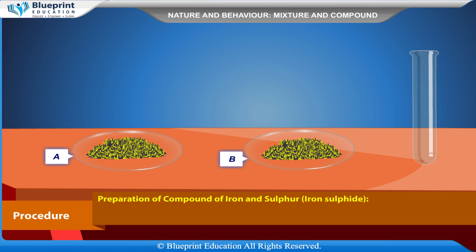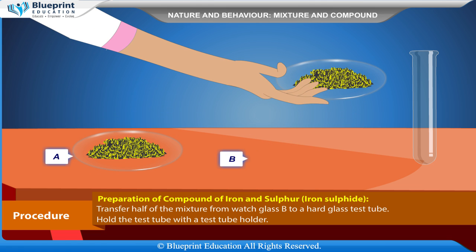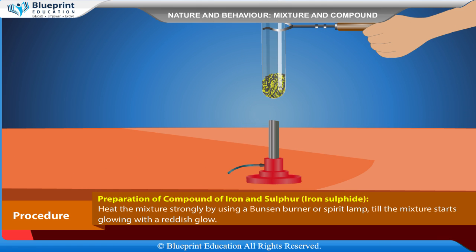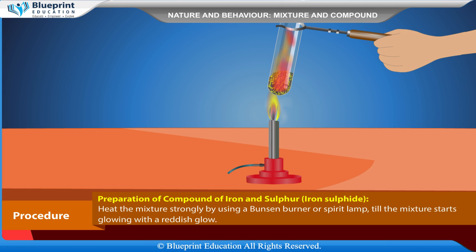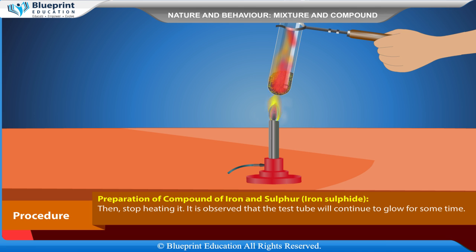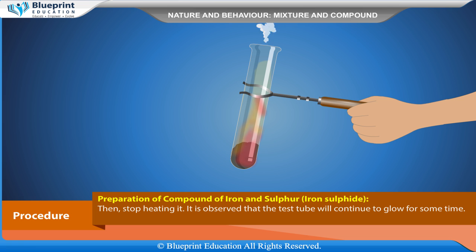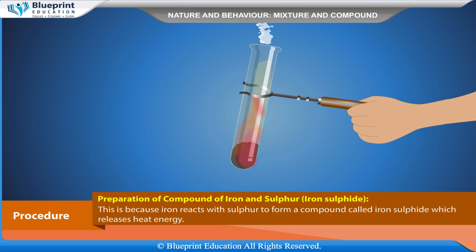Preparation of compound of iron and sulfur — Iron Sulfide: Transfer half of the mixture from watch glass B to a hard glass test tube. Hold the test tube with the test tube holder. Heat the mixture strongly using a Bunsen burner or spirit lamp until the mixture starts glowing with a reddish glow, then stop heating. It is observed that the test tube will continue to glow for some time.